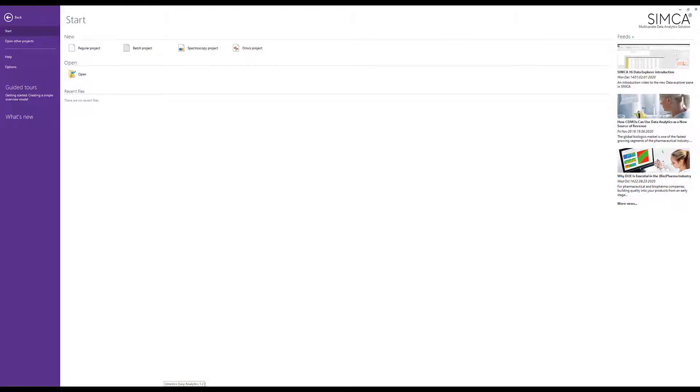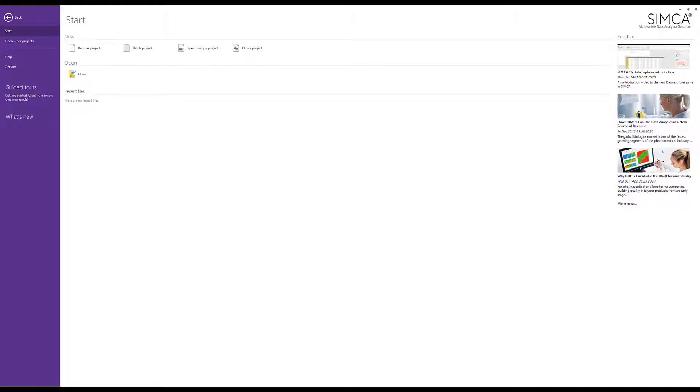For SIMCA 17 we've had a spectroscopy focus, resulting in a new integrated type of spectroscopy project. In early versions, choosing spectroscopy project triggered a skin with spectra-related functionality, but now all that functionality appears integrated in the usual selection of buttons. This video will describe how to initiate a spectroscopy project in SIMCA 17 in a proper way and what functionality it triggers to help you get the most out of your spectroscopy data.